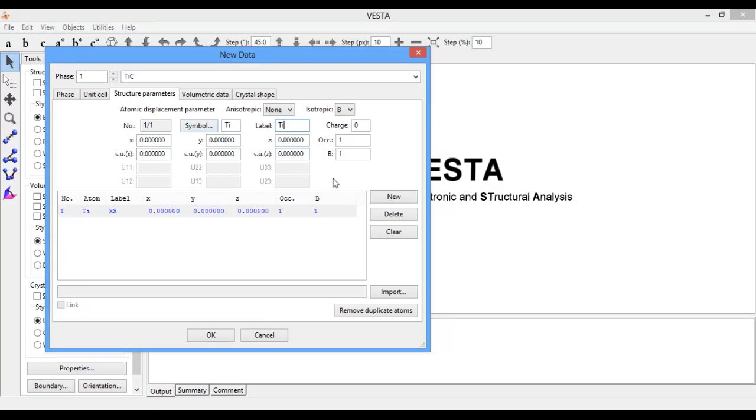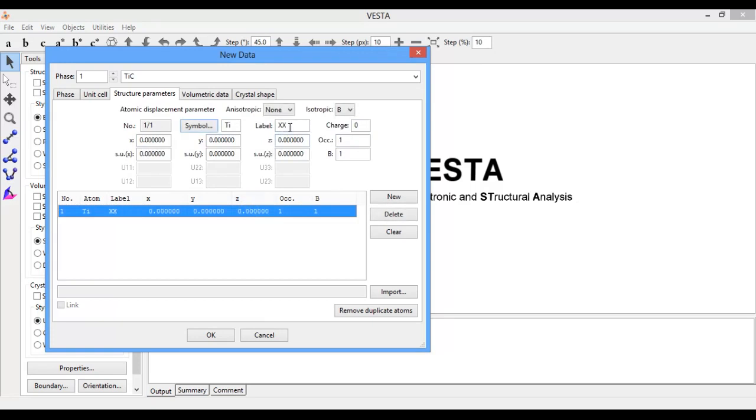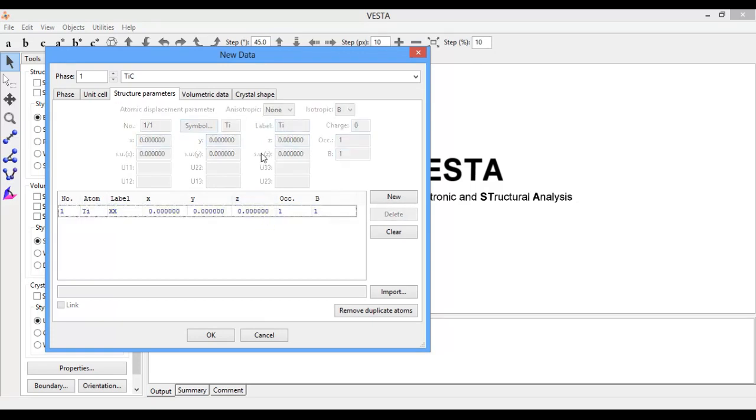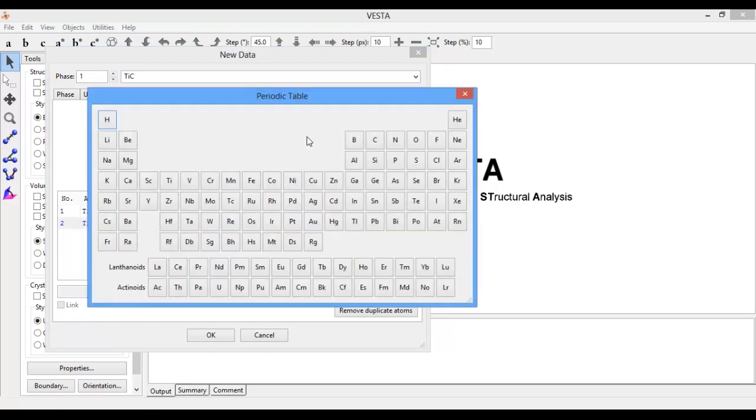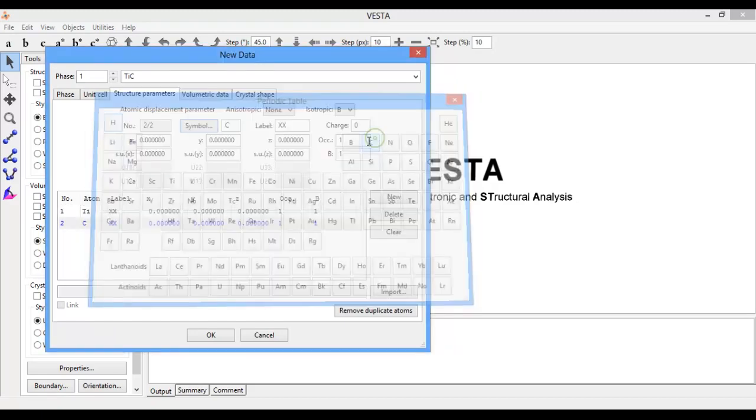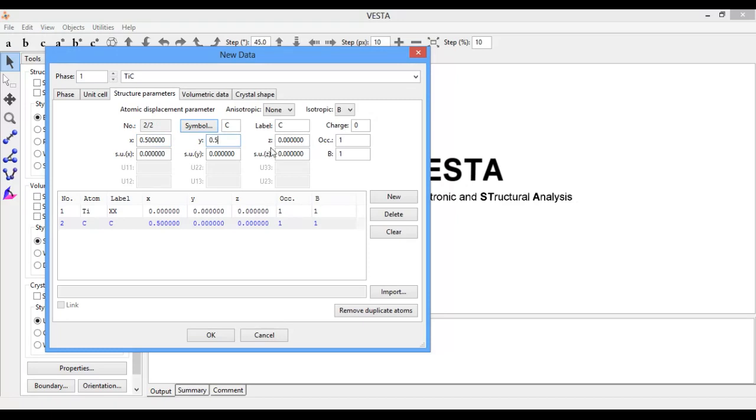This is labeled as Ti. Create new, symbol it as C. Now let's see - the carbon atom has a position of X equal to 0.5, Y is equal to 0.5, and Z is equal to 0.5.